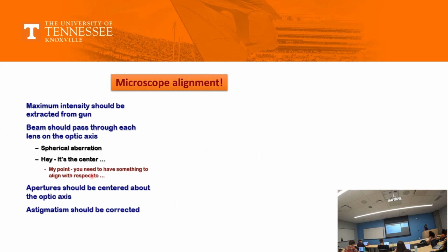Okay, so there are final remarks here on microscope alignment. When you go to the lab in JIM, they will hand you a sheet. On that sheet there are at least 20 steps. The idea behind this lecture and the past lecture is that you understand each step. I tried to be very thorough and slow in each explanation, and you should be able to start doing it.